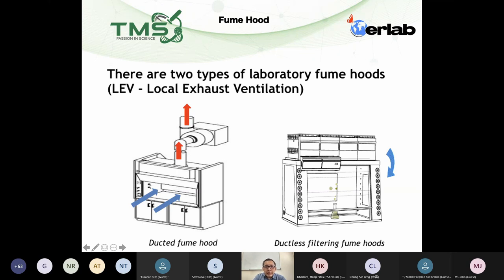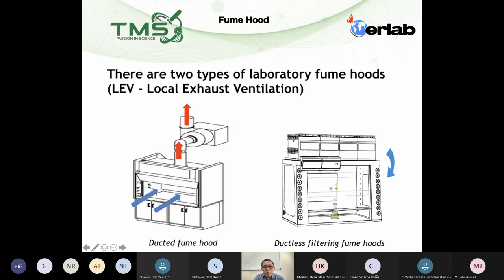For the ductless fume hood, from the name you know it doesn't have the duct or the chimney. It basically has a hood, the fan, and the air cleaner — which is the carbon filters or HEPA filters. We call that an engineering control system.